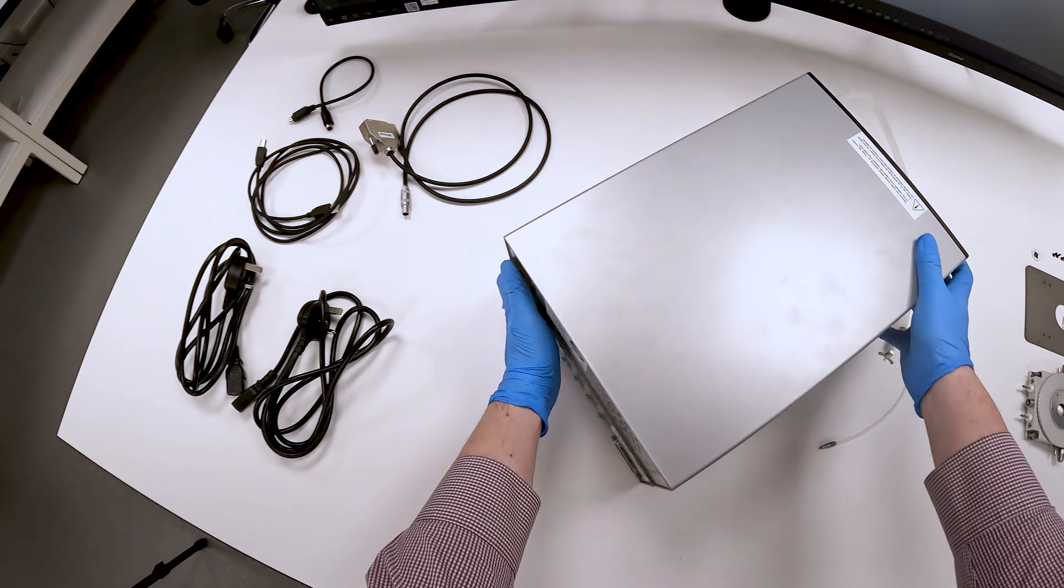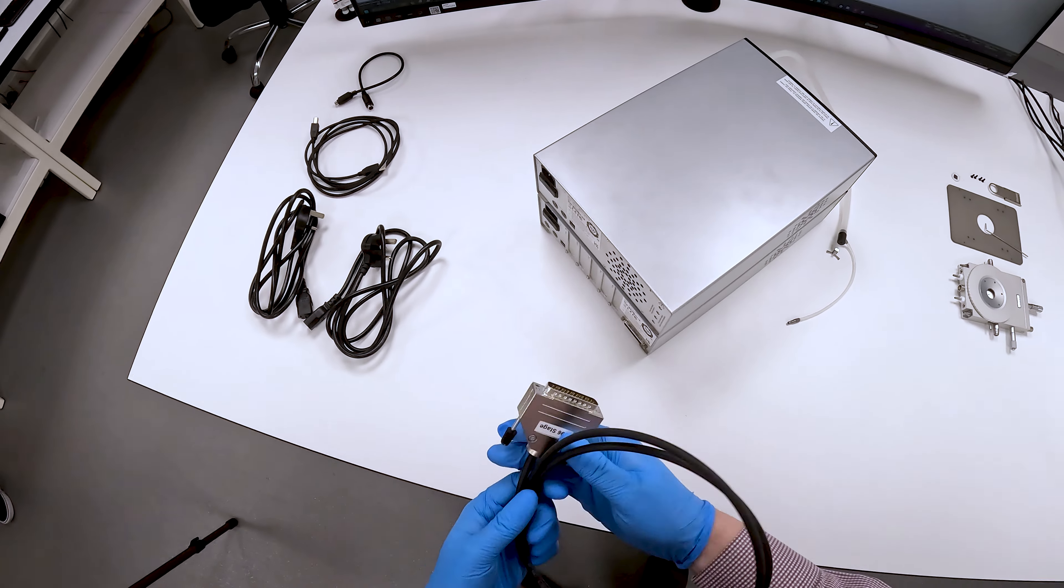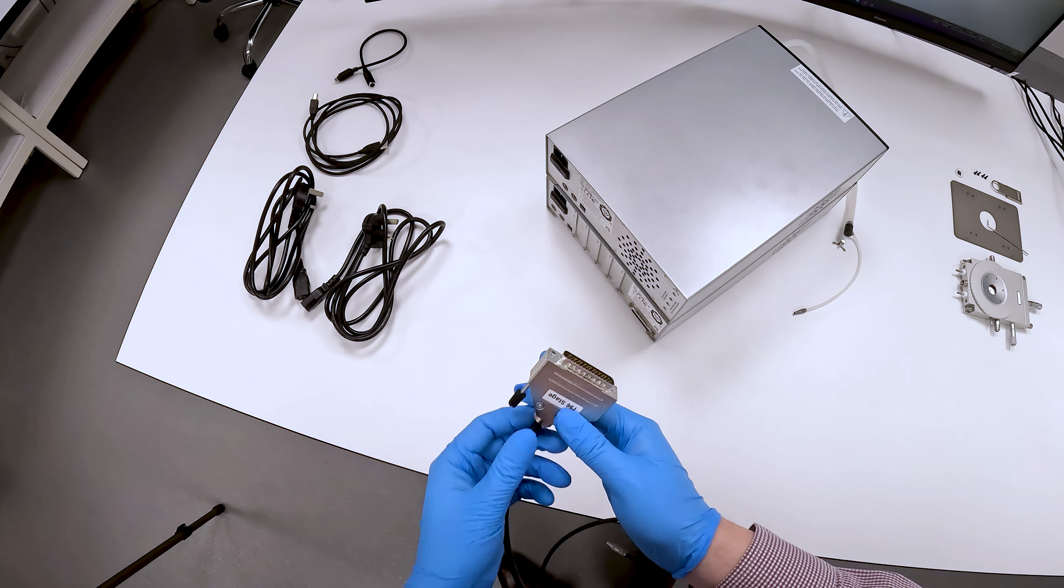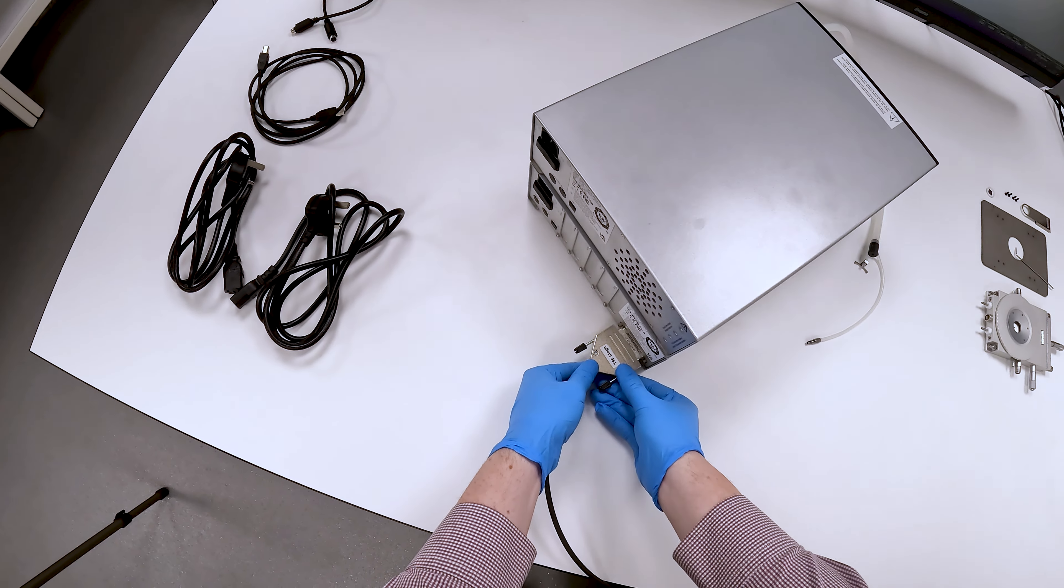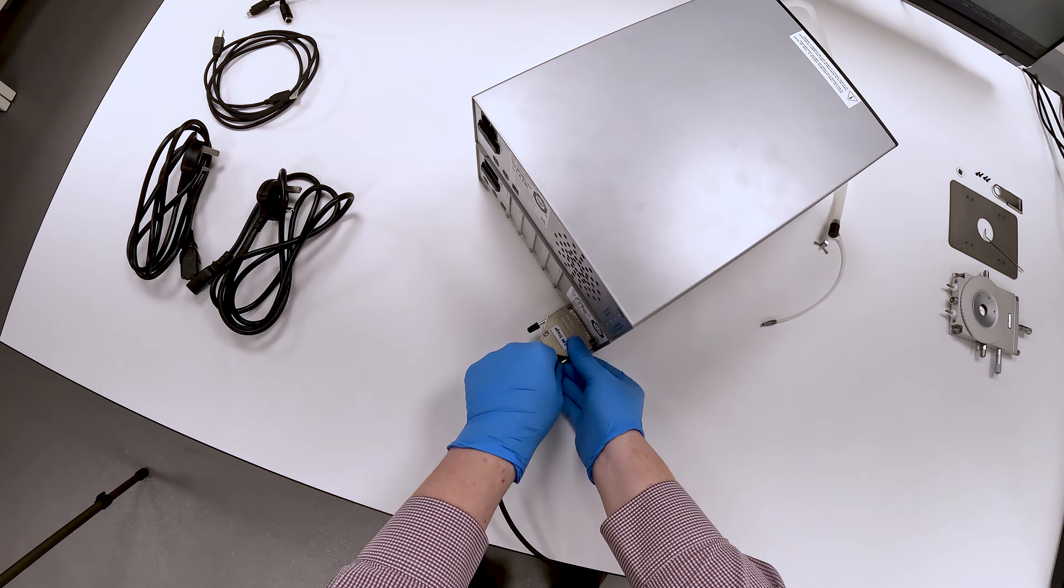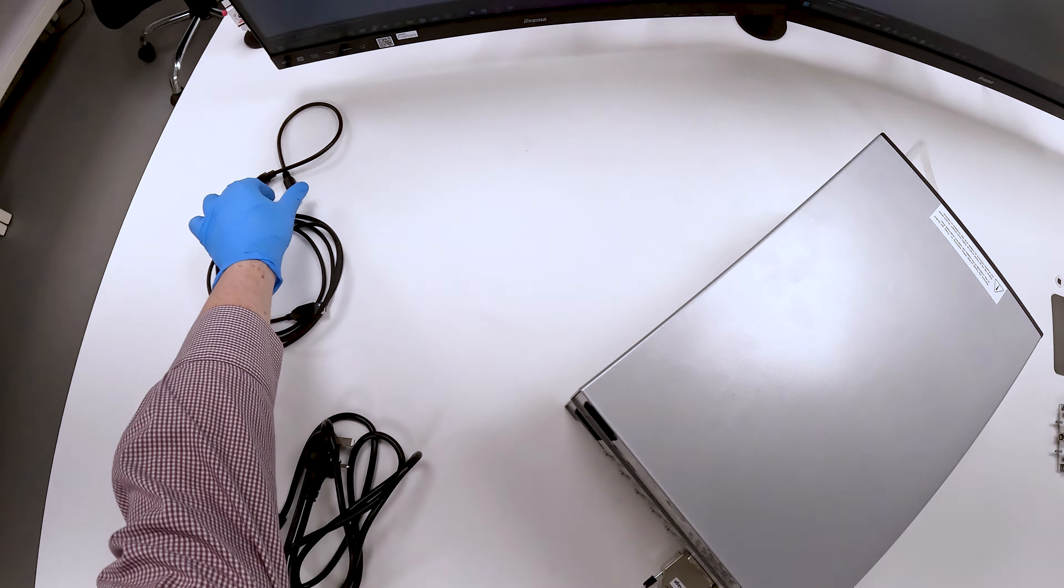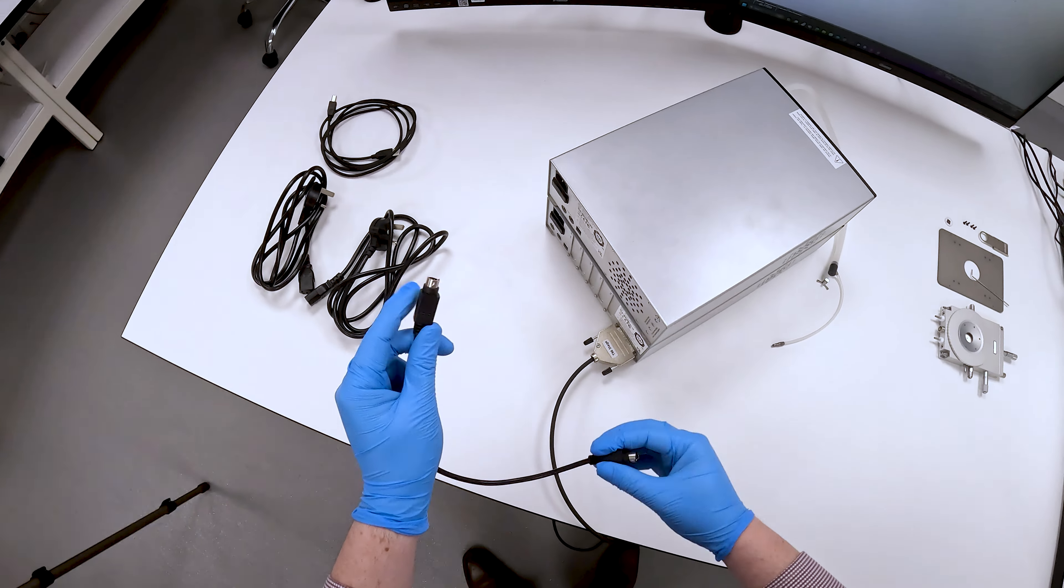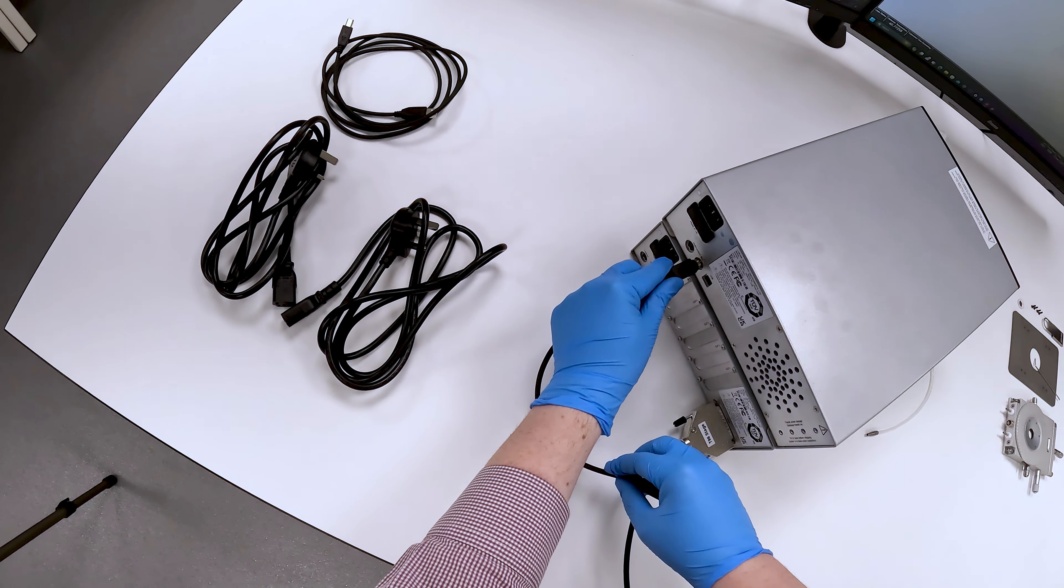The various electrical cables in your Linkam system can now be connected. These include the stage lead which goes into the T96, and the connector between the T96 and the LNP96.